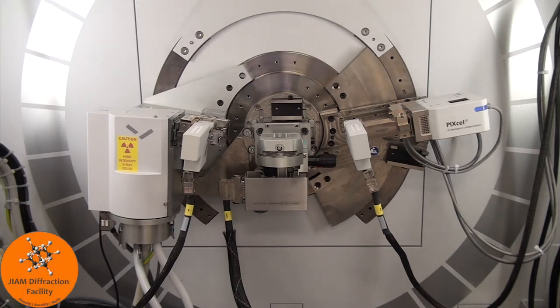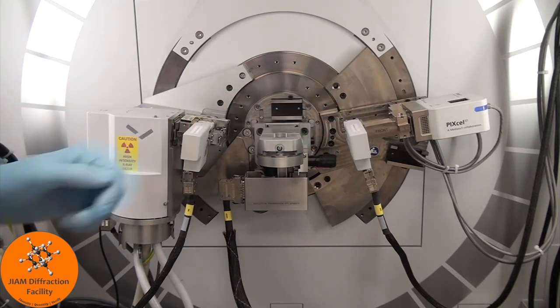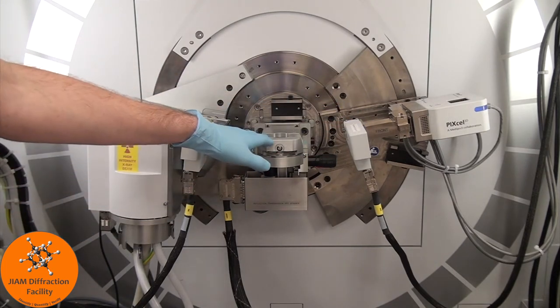This is a standard configuration in the diffraction facility for powder diffraction. The left side is the incident beam side, and the right side is the diffracted beam side. In the middle sits the sample stage.